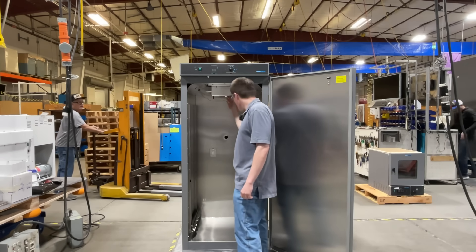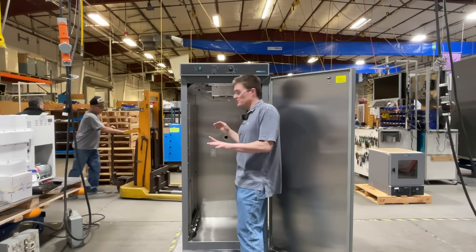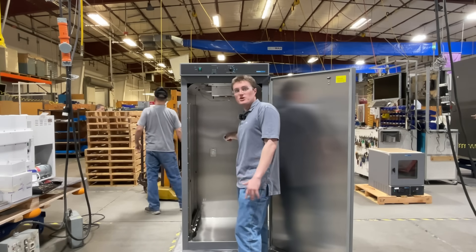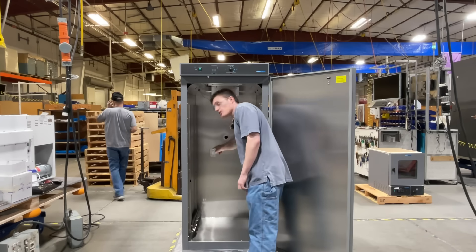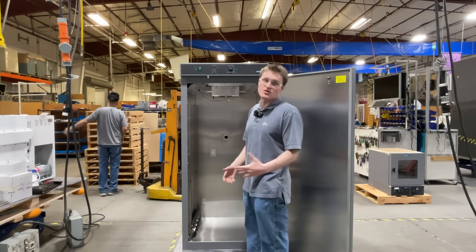Located farther back towards the unit, you'll find the Peltier control, which both heats and cools the unit. Located on the back wall, you'll find the 1¾ inch access port and 1 amp convenience outlet, should you want to power any auxiliary devices inside the unit.